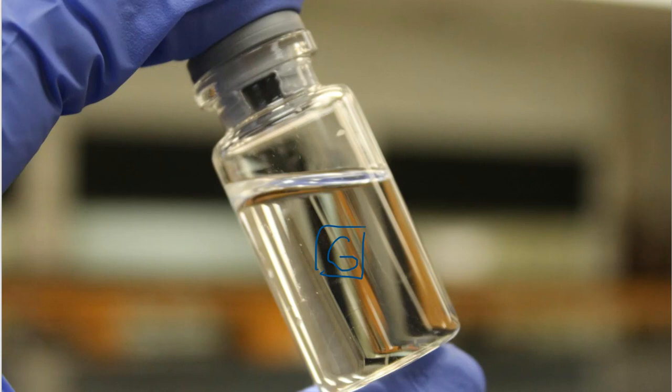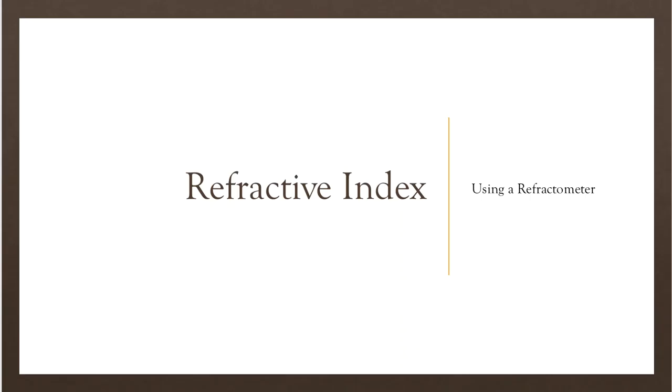So the very first test that I decide to do is something called the refractive index. The refractive index is a value, a fingerprint that I can use to help identify a compound, just like melting point, just like boiling point, just like density. And we get the refractive index from an instrument called the refractometer.